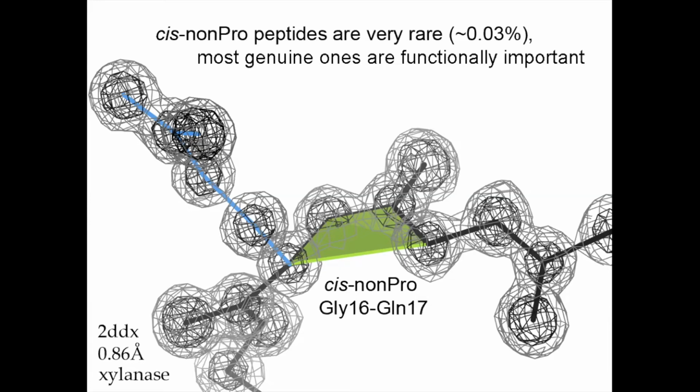And it turns out that cis-non-prolines are about 5 times as common or more in carbohydrate active enzymes. And nobody yet understands why that's true. If any of you get interested in that and can figure that out, there must be some enzymes in the carbohydrate pathways, but this is true in all kingdoms of life, so it's not a simple thing.